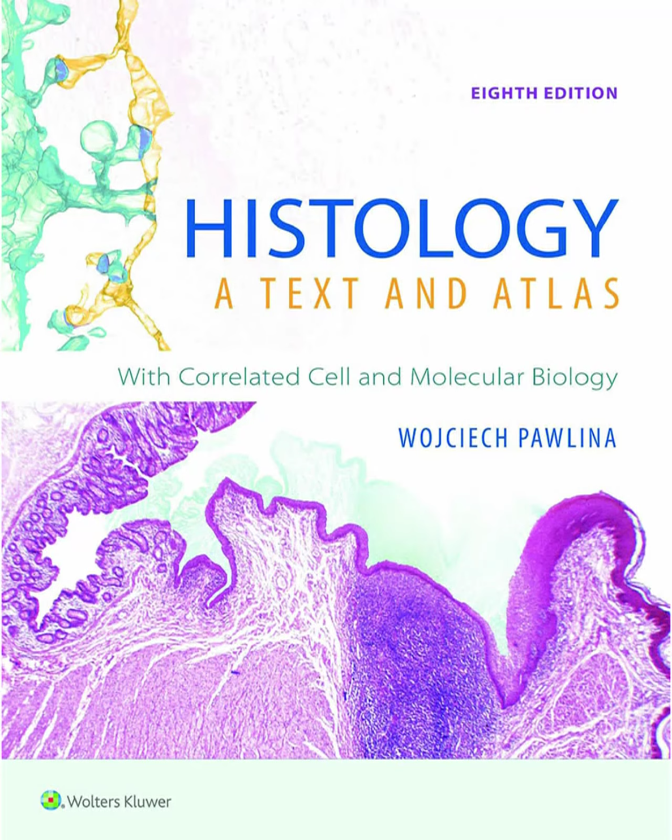Okay. And fluorescence, we mentioned that with staining. Right. Fluorescence microscopy is incredibly important in research today. You illuminate the specimen with UV light, or a specific wavelength of visible light, and fluorescent molecules, fluorophores that you've introduced, maybe tagged antibodies or fluorescent proteins, absorb that light and then emit light back at a longer visible wavelength, making specific structures glow brightly. Like tiny beacons inside the cell?